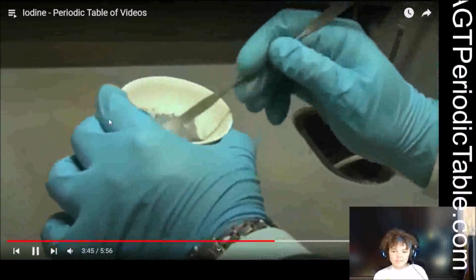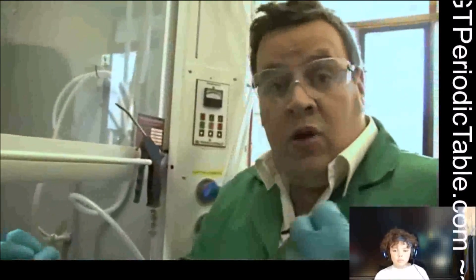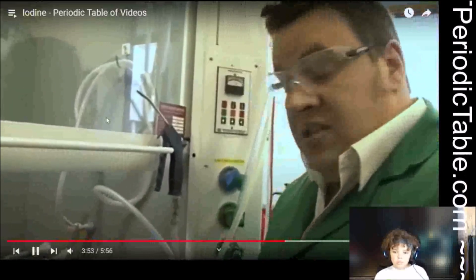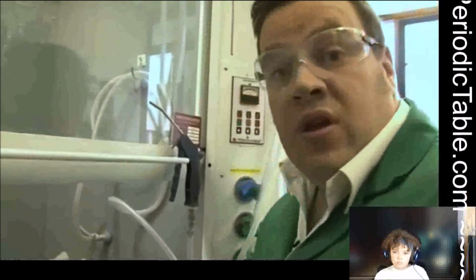Now still, these two elements are held away from one another. They can't react. So what we need to do is add a small amount of water, which acts a bit like a solvent, but it also activates the iodine, and then we'll wait and see what happens with the chemical reaction. Iodine can be used as a disinfectant. In fact, chlorine can be as well, but a solution of iodine is often used when people have cuts.